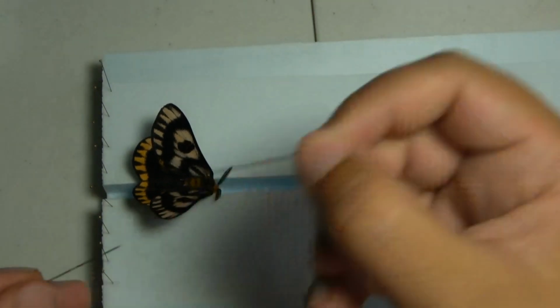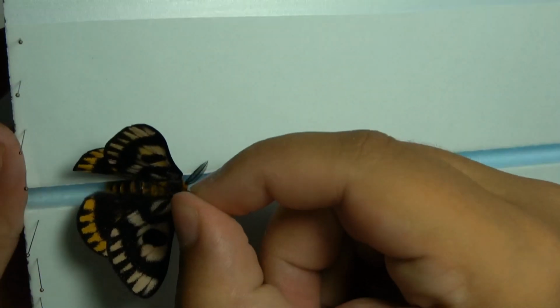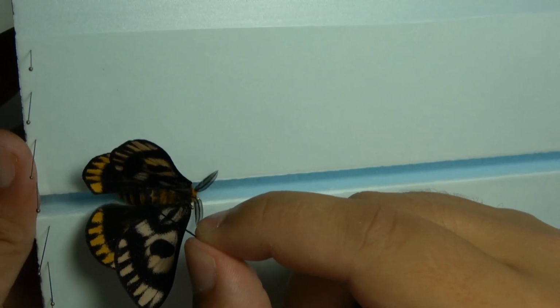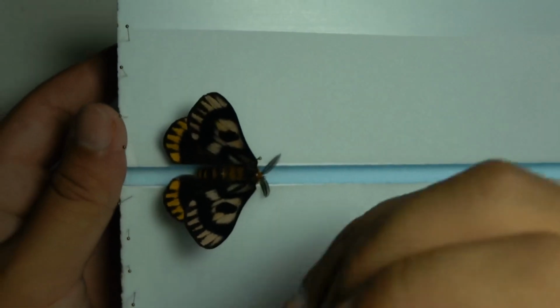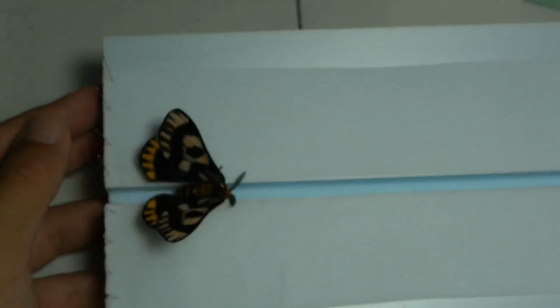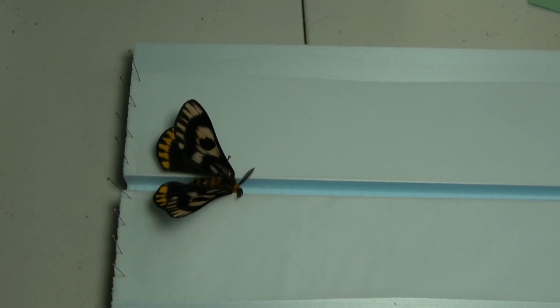Then what I do, I take two pins and use these as anchors on the body. I put one on each side. I put the pins up towards where the wings are attached to the body, so up by the thorax, where the thorax attaches to the abdomen. I push down, and this makes the body secure, so when you're moving the wings, the body doesn't move on you.